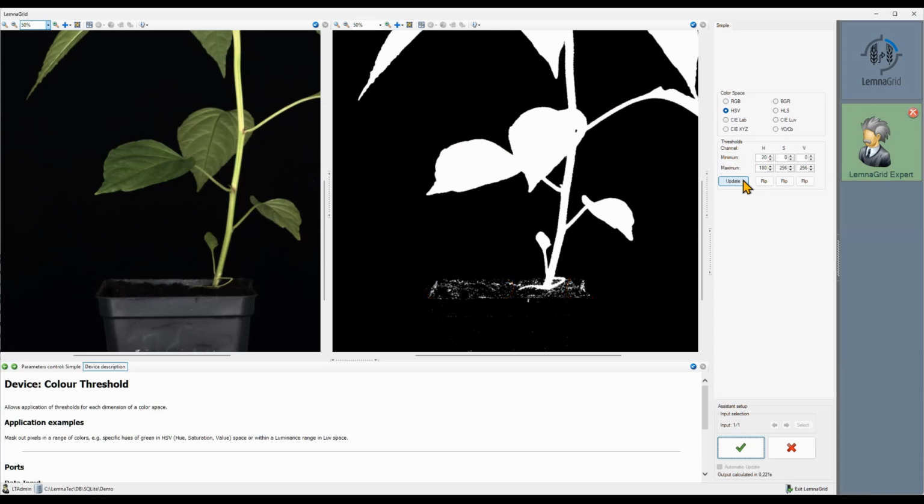On the other hand, this demonstrates why it's important to prepare your samples properly. You should not use wooden sticks to stabilize the plant. Use something blue instead. It makes the segmentation easier, and you won't need to do too much of a compromise. The same applies for the soil and the pots. Use black soil in pots if possible. Okay, we are done here.